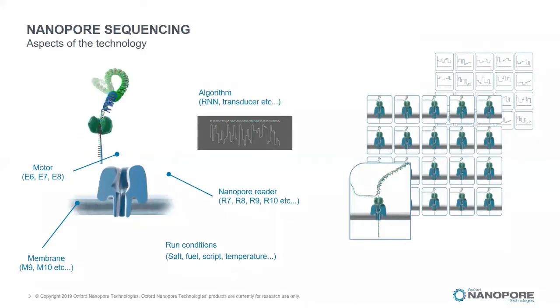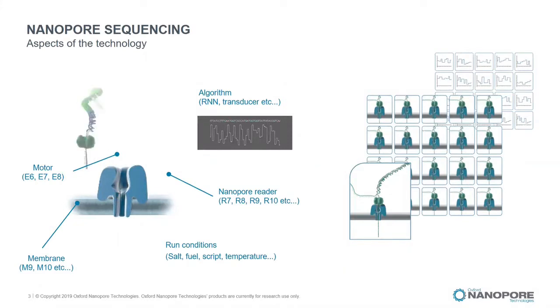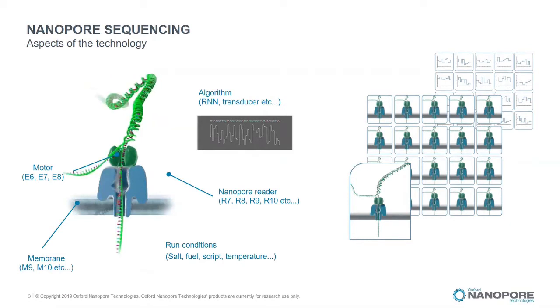So this is nanopore sequencing. We call it nanopore sensing. For any DNA or RNA fragment, during library preparation we attach the adapter sequence. The green part is the motor protein in the sequencing adapter. So during library preparation you attach the sequencing adapter, and the sequencing adapter splits the double strand into one strand and pushes the molecule into the nanopore hole.